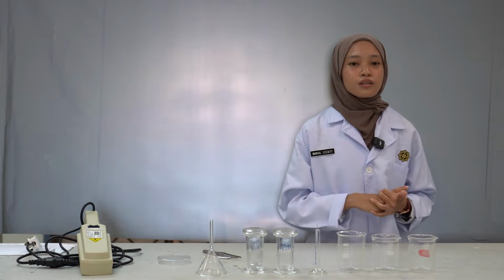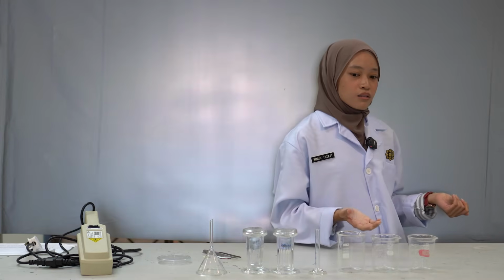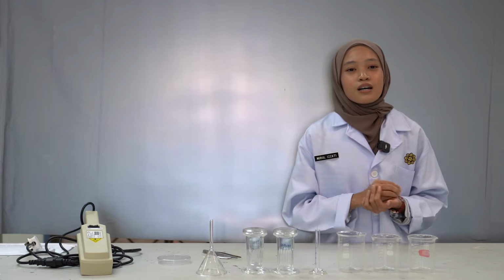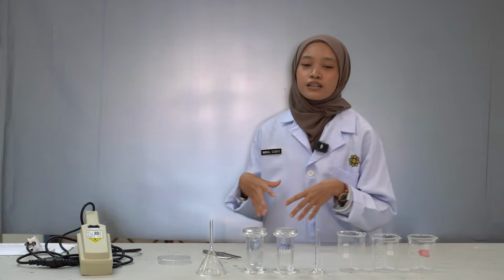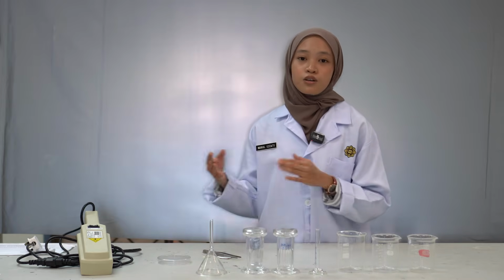Next, still in the pharmaceutical industry, TLC is also used for reaction monitoring. When a chemist wants to produce a new complex drug molecule, the reaction can take hours and even days to complete, and they can't wait till the end to see if it is complete.